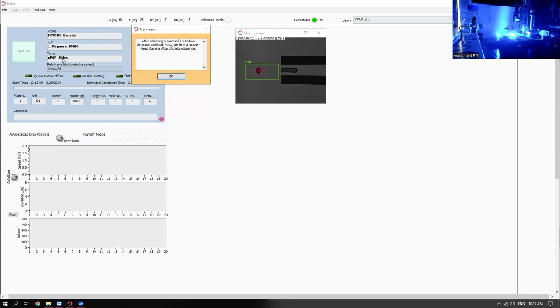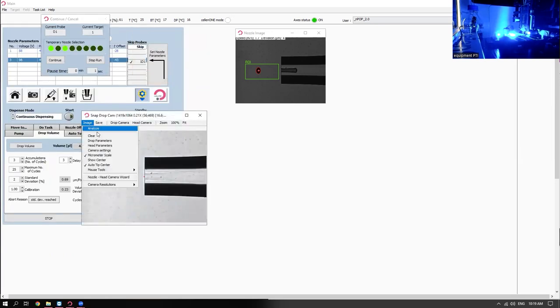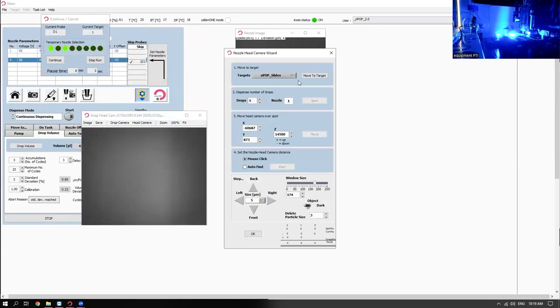After achieving a successful auto drop detection with both PDCs, perform a nozzle head camera wizard to align dispense. That head camera, which is going to do all of that imaging for us, never sees the nozzle. So we have to essentially correlate the dispensing location of both nozzles to each other. We've got to put cells and droplets with DMSO, and we also want that camera to know where our droplets are going so that we can analyze them properly. So this next step is where we go to this nozzle head camera wizard.